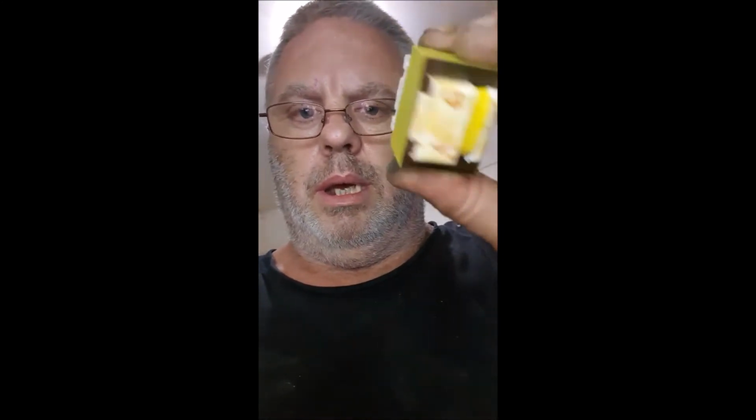So I haven't made copperas before. I'm going off the information that I've been given. While we're on the subject, I owe Harold a big thank you. Harold's from the Gold Refiners Forum. I got the information off him on how to make this copperas, and so he deserves the credit. Just like if you use something that you've seen on my videos, it would be nice if you mentioned my video. It's just common sense, courtesy and all that.